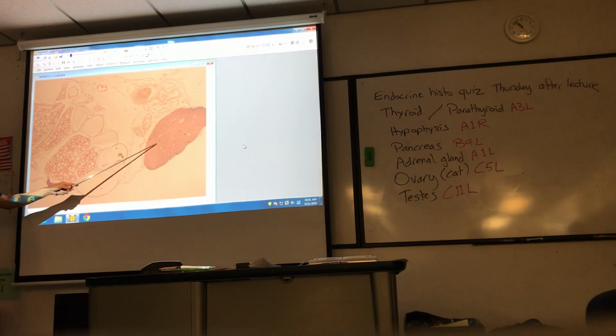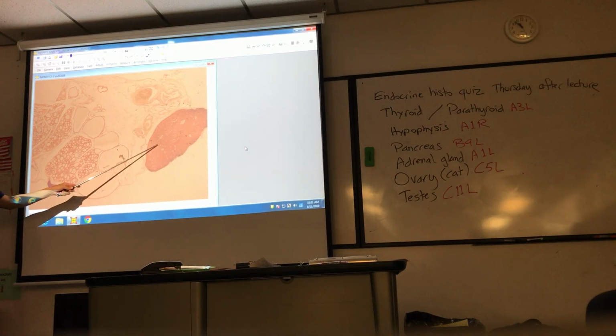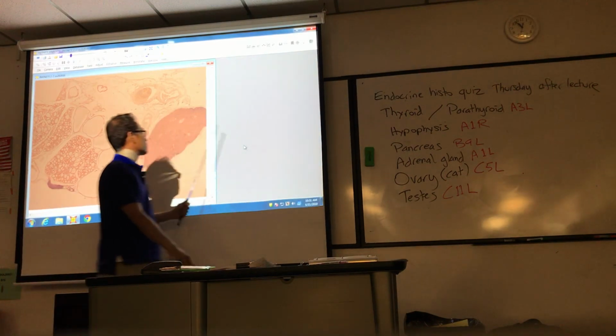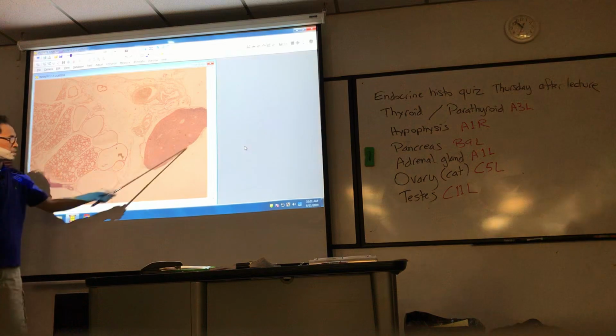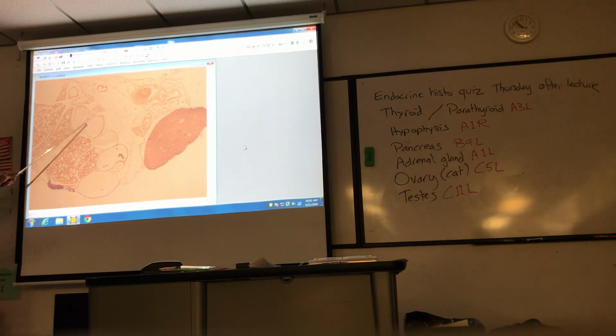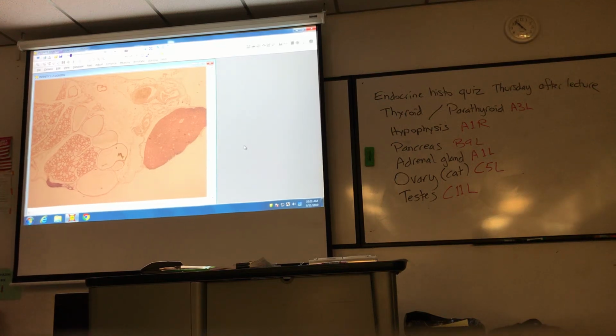Look at your study guide. What are the cells you're supposed to be able to identify? C cells, or chief cells, right? Not C cells. Yeah, chief cells. So the cells stained purple, they're the chief cells. I might have you identify the cell type. Parathyroid gland. Can you see all the follicles for the thyroid here? These ones are huge, these follicles. See, these ones are much smaller. Okay, let me take a picture of this low mag.